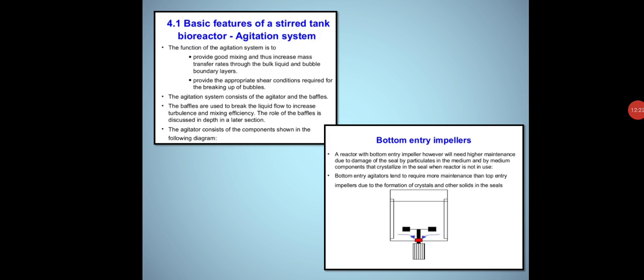See, before seeing the working of CSTR, here what I have told about the agitation system वही दिखाया है इस पहले बॉक्स में। और इम्पेलर्स की अगर मैं बात करूँ तो बॉटम एंट्री इम्पेलर्स होते हैं, टॉप एंट्री इम्पेलर्स होते हैं। बॉटम मीन्स योर इम्पेलर्स आर बीन अटैच्ड एट द बॉटम ऑफ द डिवाइस, और ये बॉटम इम्पेलर्स मेनली यूज किए जाते हैं फॉर द लार्ज स्केल इक्विपमेंट। ओके, मीन्स फॉर द इंडस्ट्रियल यूज द बॉटम एंट्री इम्पेलर्स आर बीन यूज्ड। द मेन थिंग ऑफ दिस बॉटम एंट्री इम्पेलर्स इज it prevents the contamination। Okay, as the mechanical agitation has been provided, so it prevents the contaminants from entering into the bioreactor, as I have told. So that is the bottom entry impellers.